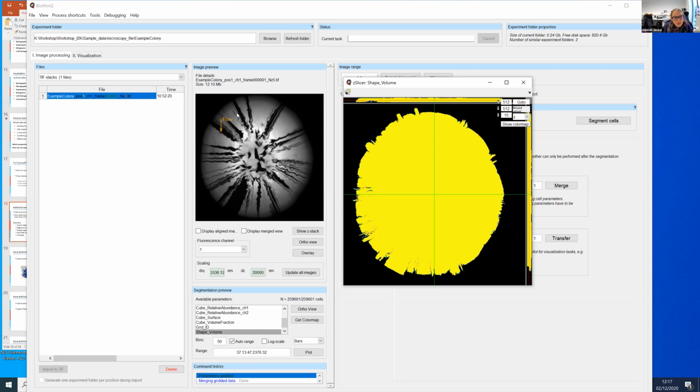Probably I didn't do the thresholding perfectly, and in some places, for channel 2 specifically, the threshold is a little bit too low. That's why we have this sticking out here. But for the purpose of today, I'm not very much of a perfectionist. I'm happy as it is. I'm happy that the whole colony is filled with cubes, at least in the central layers.